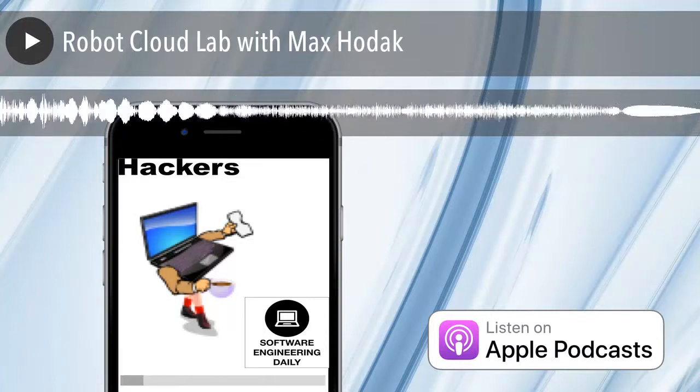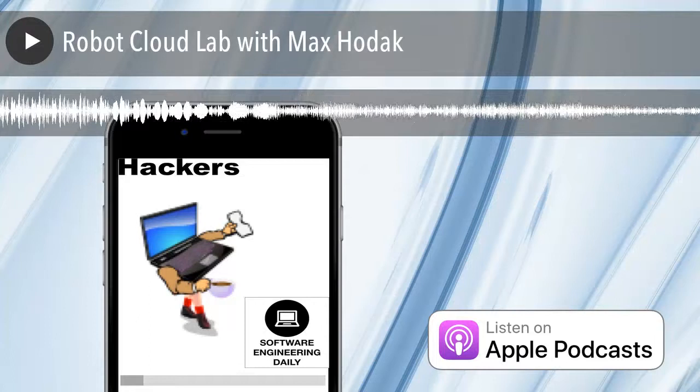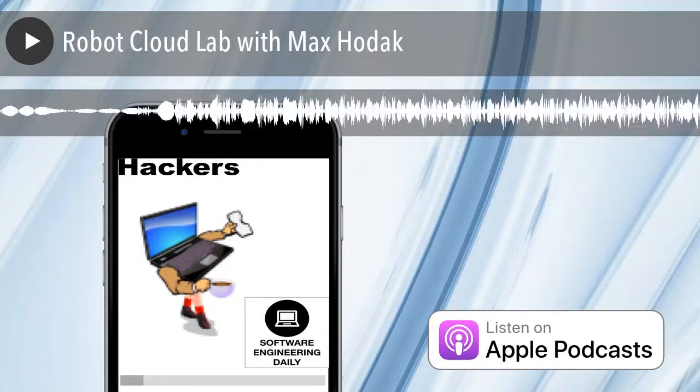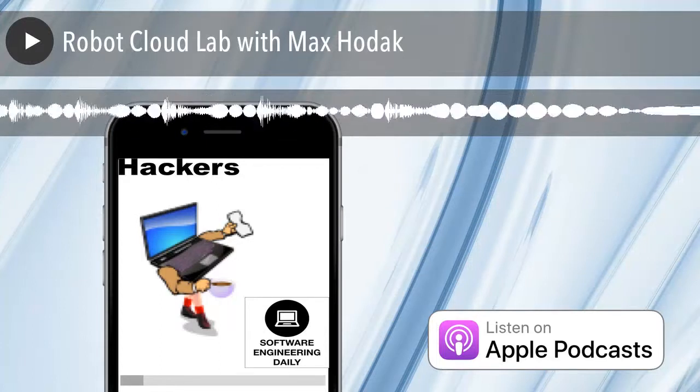You mentioned drug discovery as one example of a type of experiment. What are some of the other types of customers that Transcriptic has, and what are the typical jobs that they're submitting? How does it fit into their workflow as a corporate entity or a university entity?